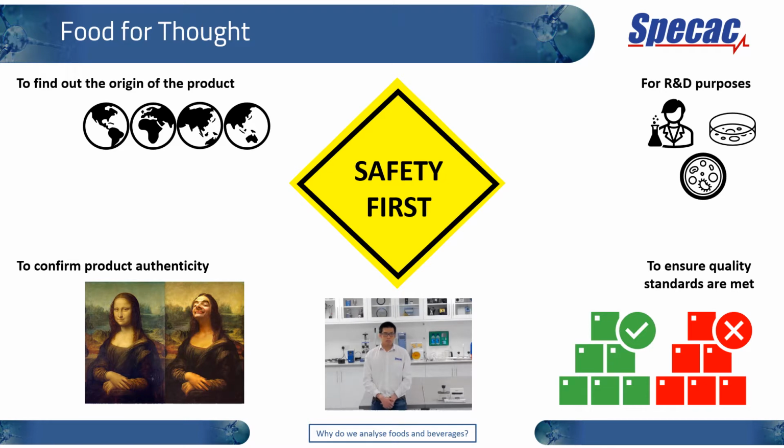But ultimately, all these variables contribute to the safety of foods and beverages to ensure that there are no harmful substances contained in the product that endanger human health. If there are certain substances that are allowed but can't go over a specific limit, we also want to have a solution for quantitatively and qualitatively measuring those specific limits as well.